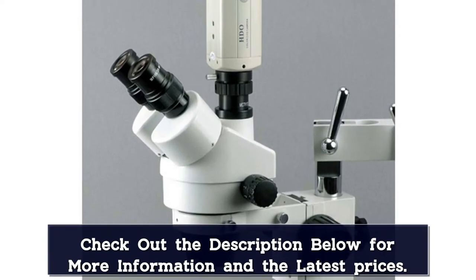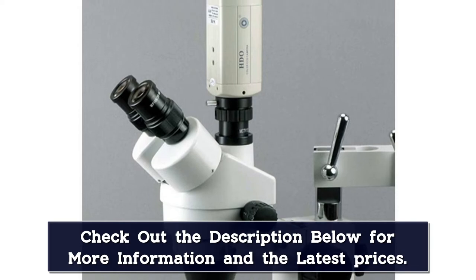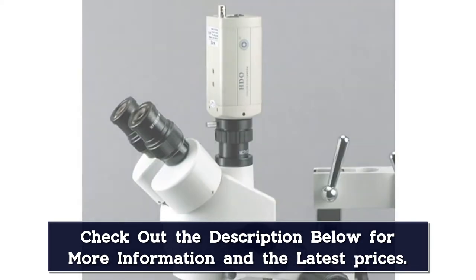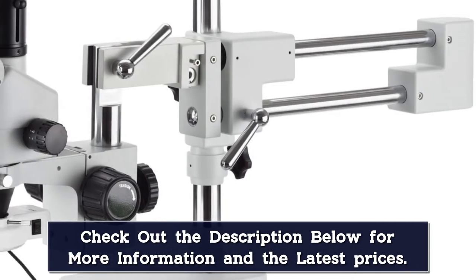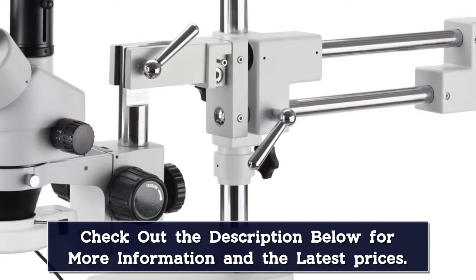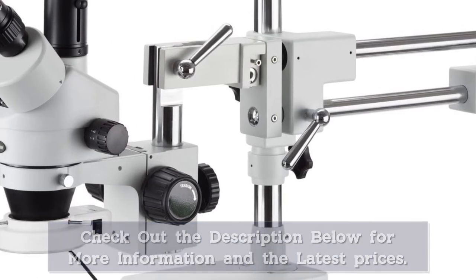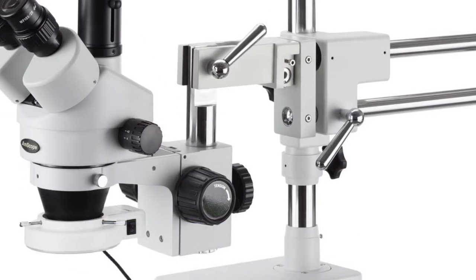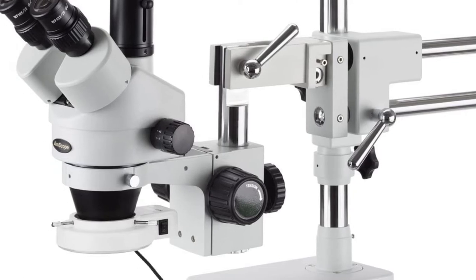This feature ensures that you can go back and forth from detailed inspection to a broader scope in less time. This model is ideal for fast working conditions. Stereo boom microscopes allow you to see more objects since they aren't limited by a stage plate. This version has a double arm boom for maximum stability and flexibility. You can turn the head and swivel the arm as much as necessary to get the right angle on your subject.